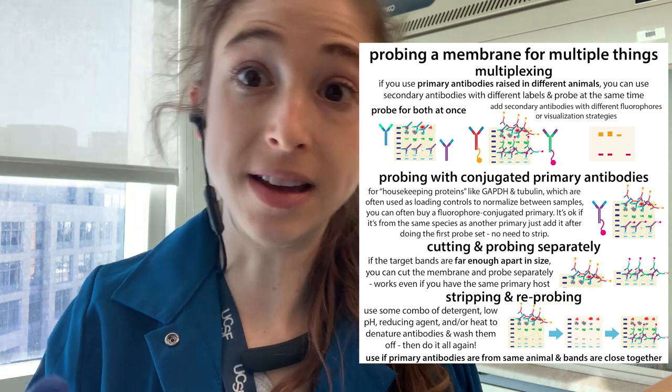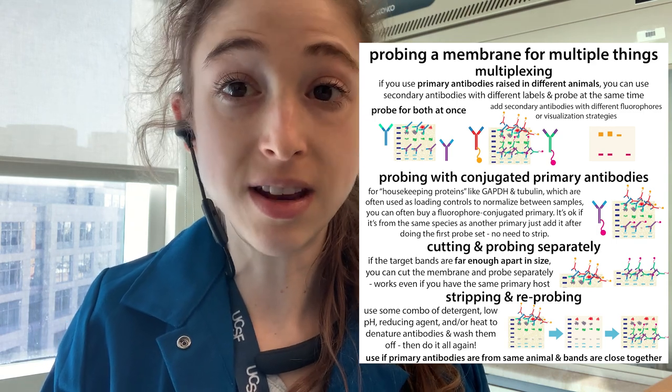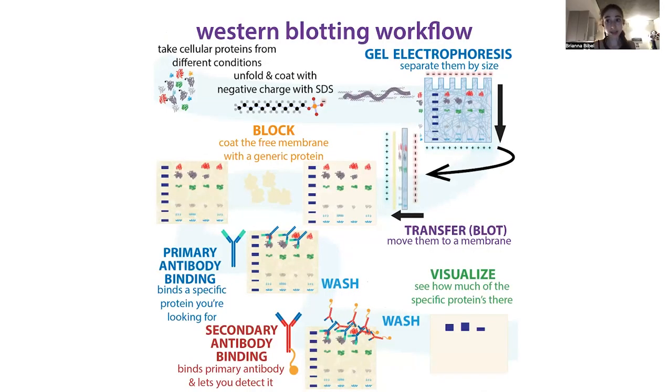So we need to get back and talk about what the Western blot's doing, how these probes work, and how we can take advantage of how these probes work in order to probe for multiple things. If you're still listening and you're interested in this topic, I'm guessing that you have a basic understanding of Western blotting, but if not, I have much more in other posts. The basic idea is we use gel electrophoresis to separate proteins based on size, transfer them to a membrane, and then probe that membrane to see whether a specific protein is there and how much of that protein.